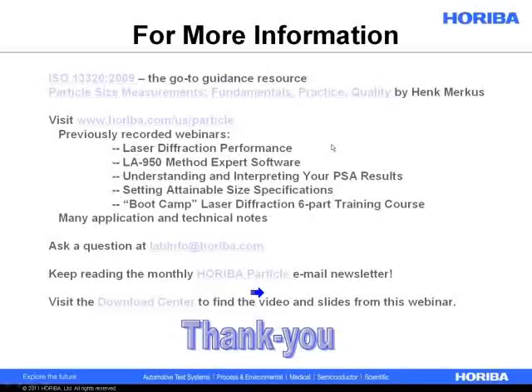The absorbing particles are going to absorb some percentage of the investigating light, which means that the amount of scattered light will be less and it won't be a true reflection of the total volume of the particles. There, I think that was reasonably coherent and to the point.